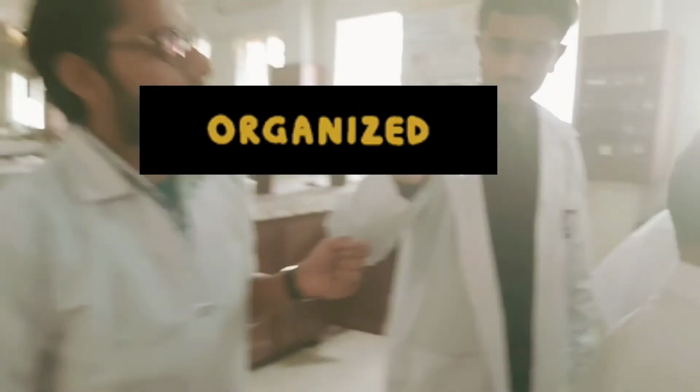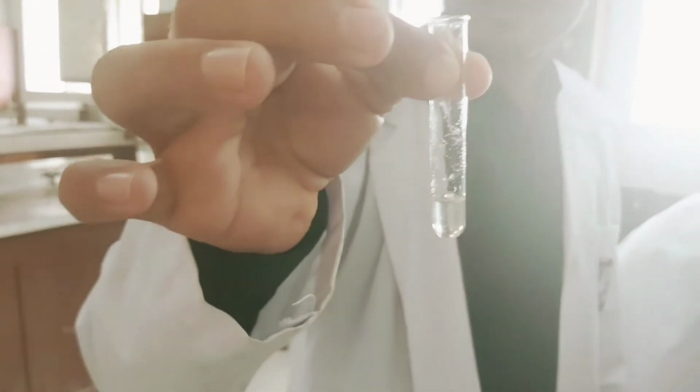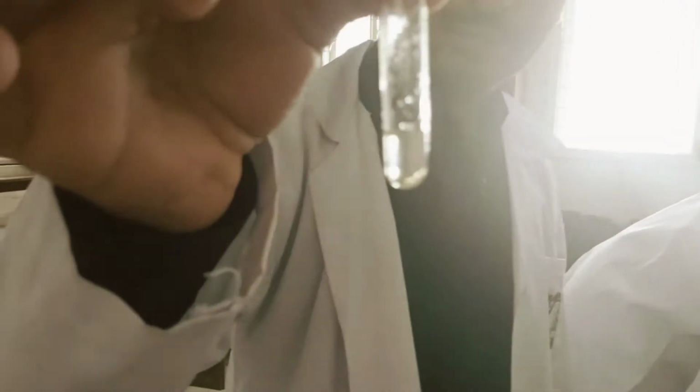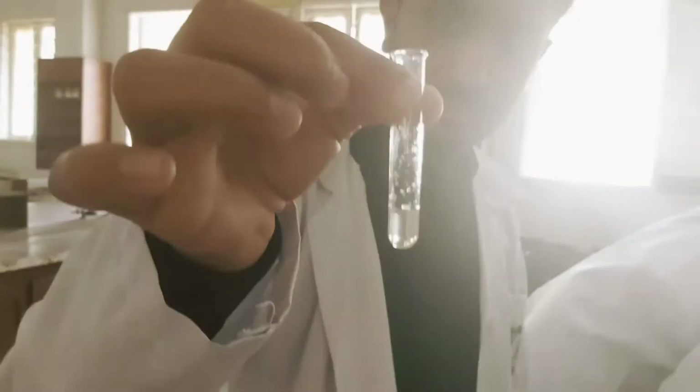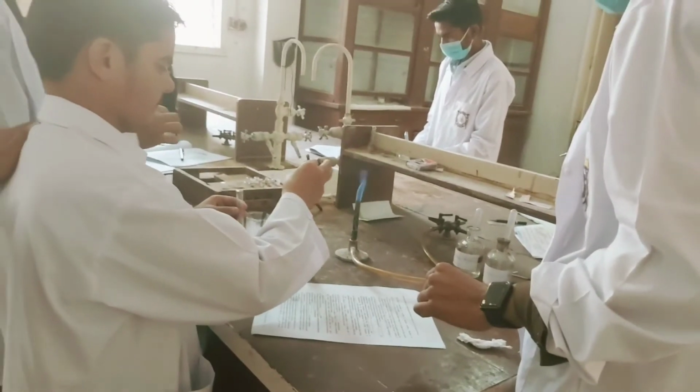Which test is this? Concentrated sulfuric acid. So it got dissolved at room temperature? Yes, ma'am. We are doing another one, the dilute one. So you have checked in the concentrated sulfuric acid? Yes. Great. Do the same test, repeat it with the dilute one.